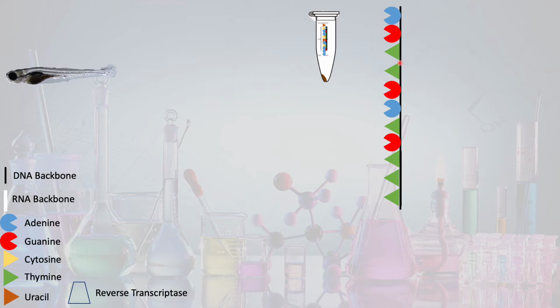And then this is going to have a complementary strand also built and added to it when we move to our next step. So through this process, we are selectively creating DNA that's specific only to our mRNA, again, from that poly A tail. So the only thing we've amplified now is messenger RNA. We're leaving the rest of the RNA behind.